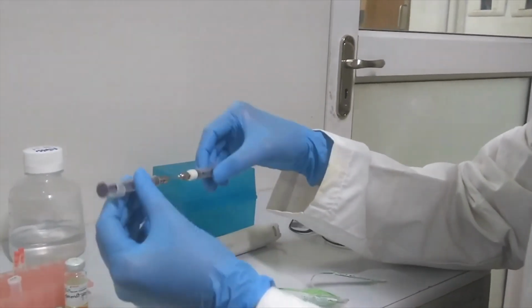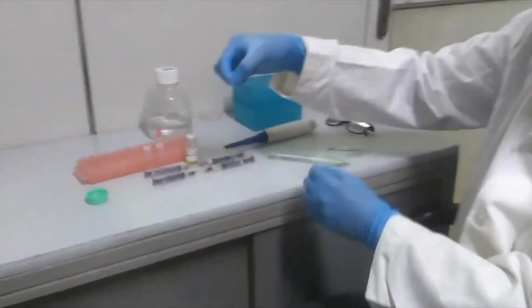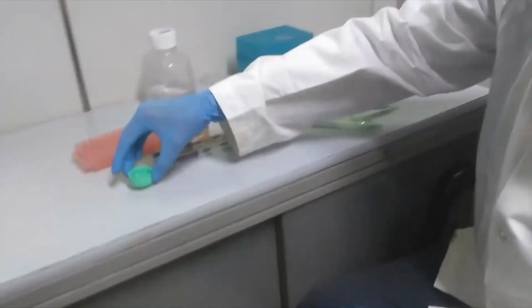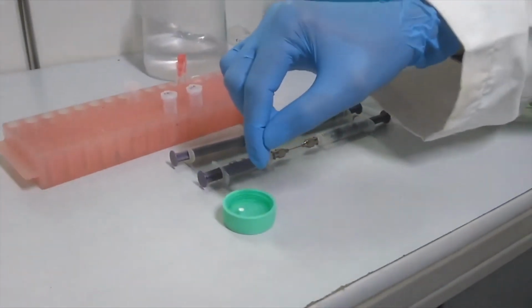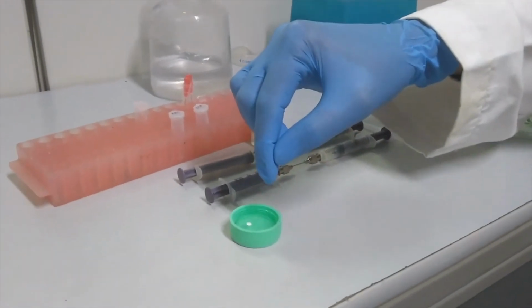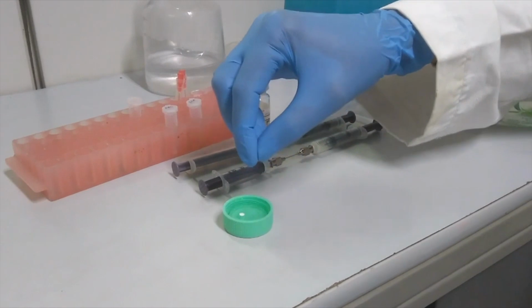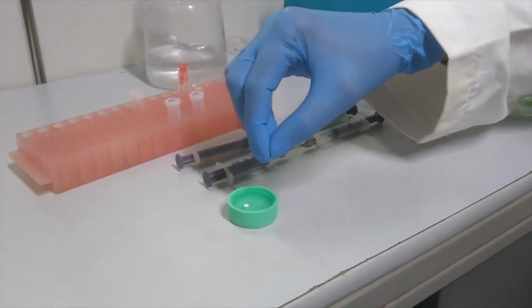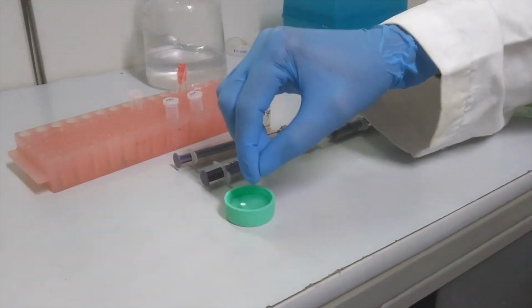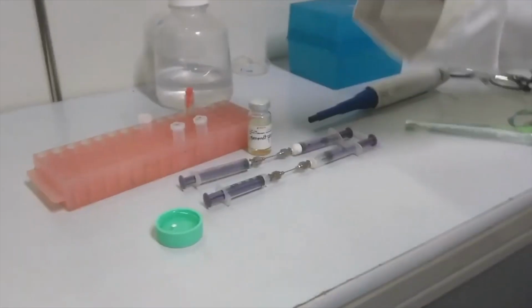So how do you check them? For checking purposes, we drop a drop of emulsion on a water surface like this. If the emulsion is not formed perfectly, this will spread out. Otherwise, it will not spread. So this is a check that your emulsion is formed correctly. Once you find that this drop is not spreading, your emulsion is actually ready for injection.